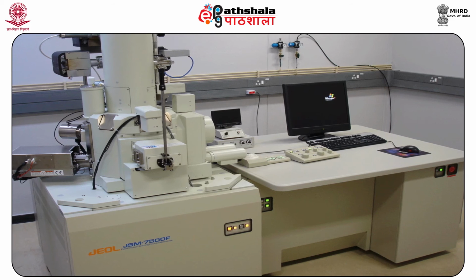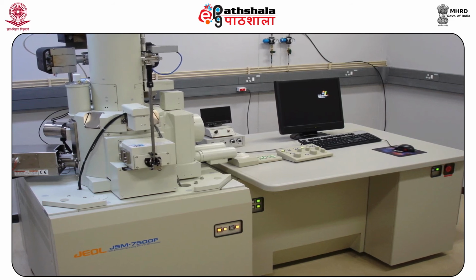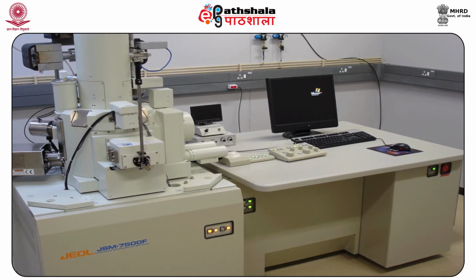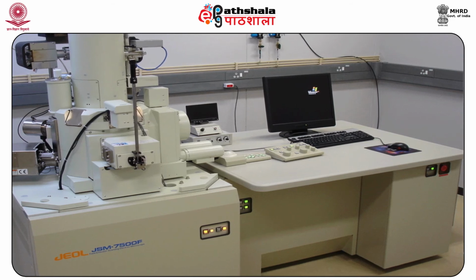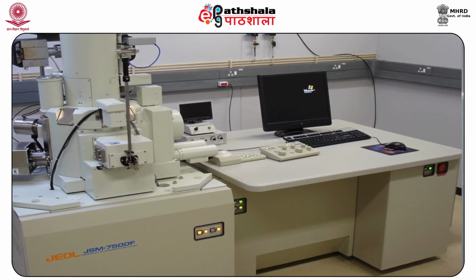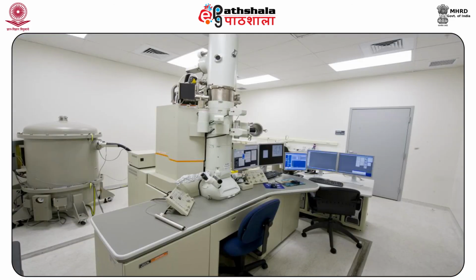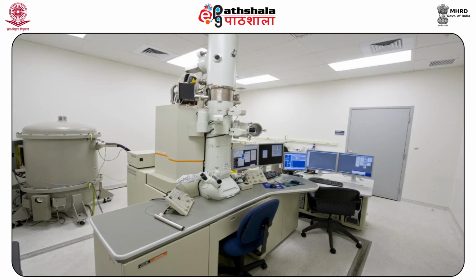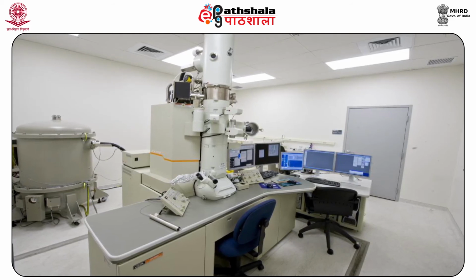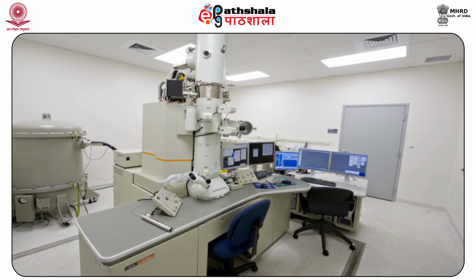In this chapter, we have learned that a beam of electrons visualizes the object under observation rather than visible light as in a conventional optical microscope, as the beam of electrons is focused by a series of magnets rather than glass lenses. The control is infinitely finer over here. And because electrons behave like waves of much smaller wavelength, it has resulted in much more magnification, higher resolution, and greater depth of focus.